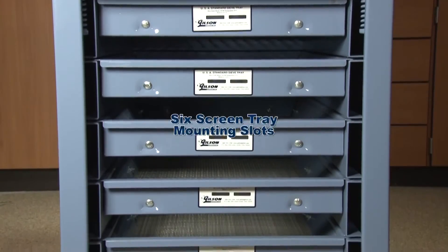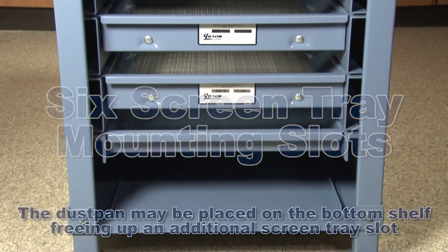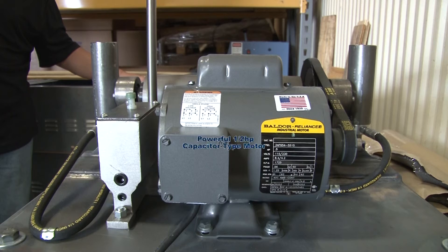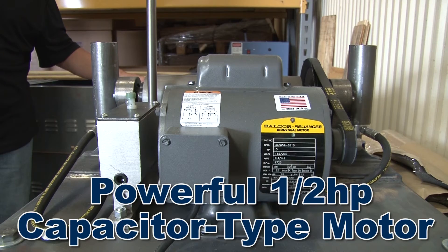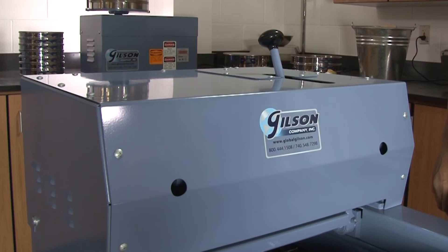Testing screens have six mounting slots for screen trays and a dustpan for fines collection. The powerful half-horsepower motor and drive mechanism is operated through a starting switch with built-in overload protection and is completely enclosed for added safety.